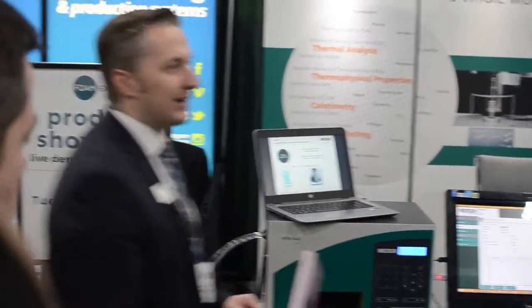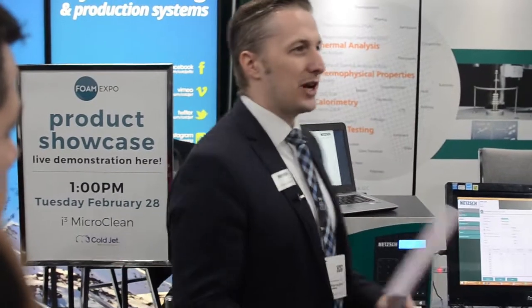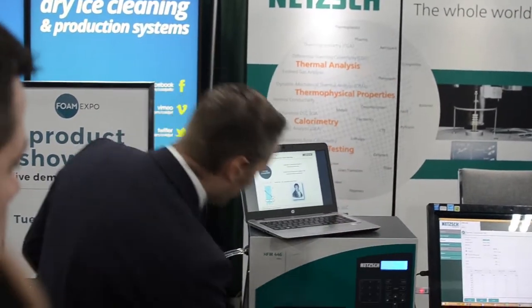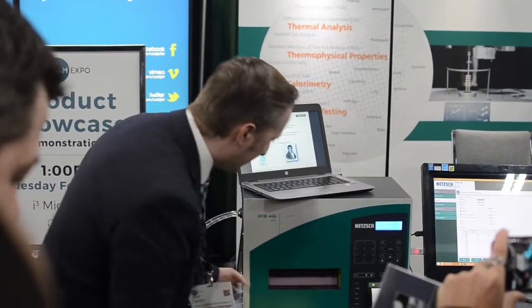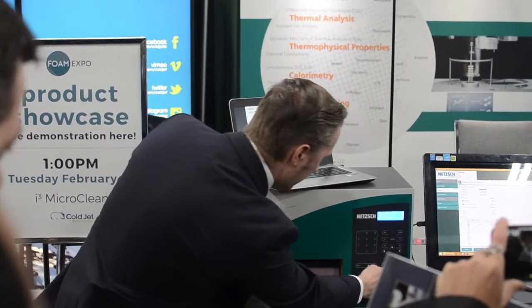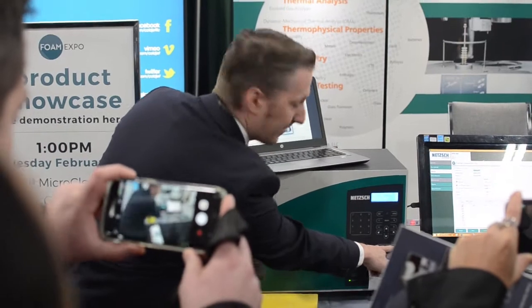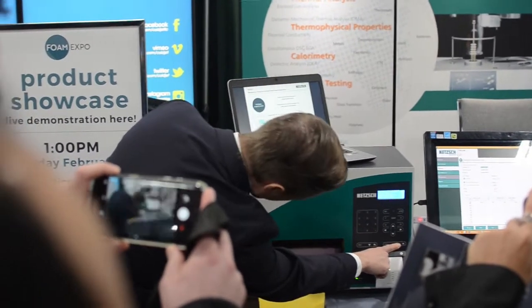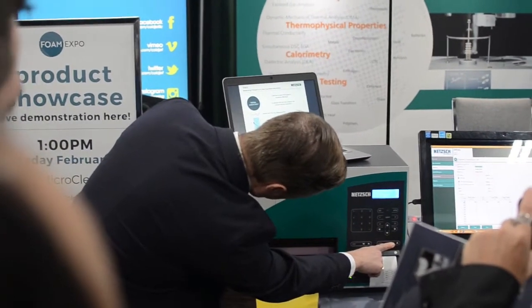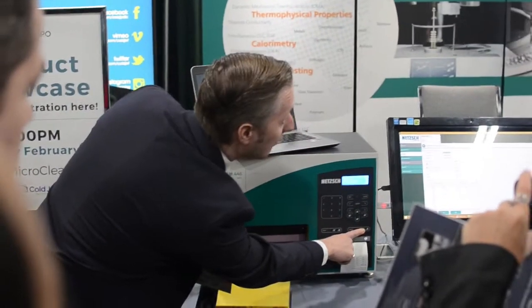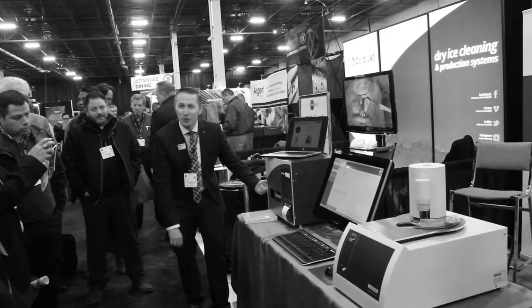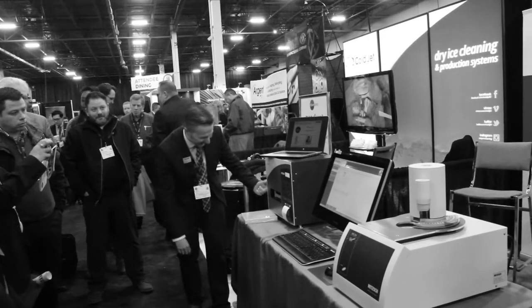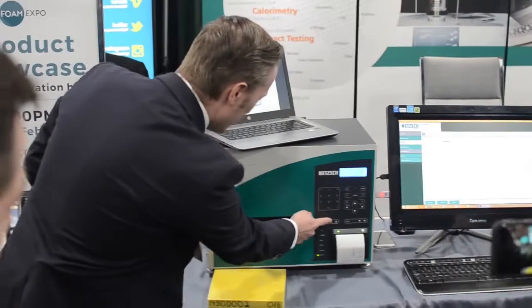Let's start and demonstrate how easy it is. We take a sample like this — every one of you is used to having such samples. You insert it into the instrument, you close the stack. Two-finger safety — very important, two-finger safety. You close the door.